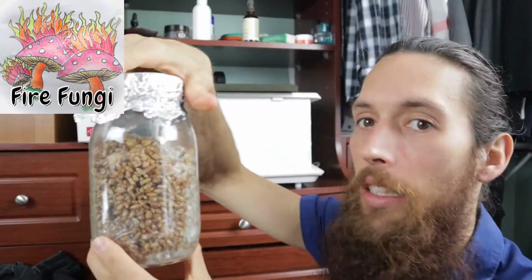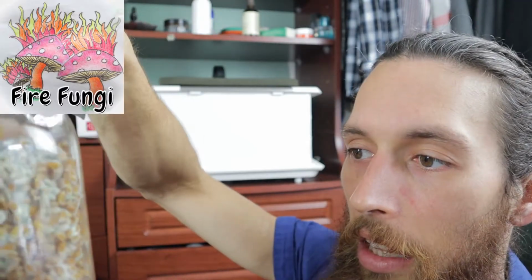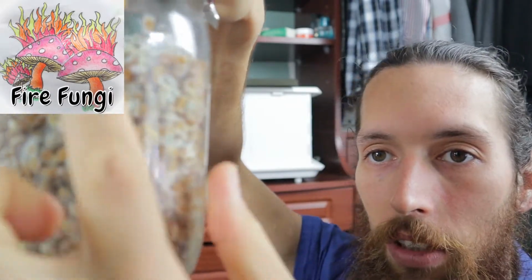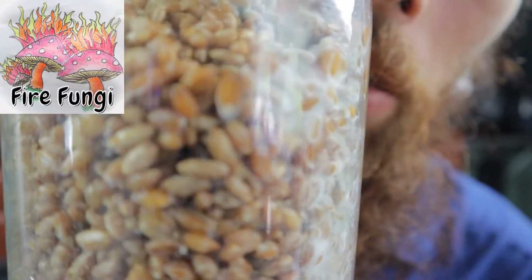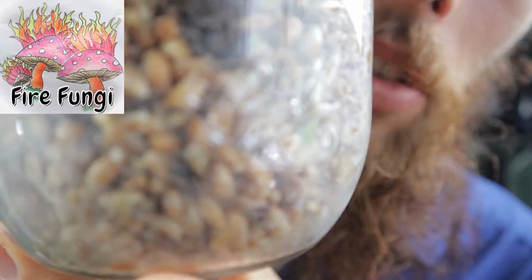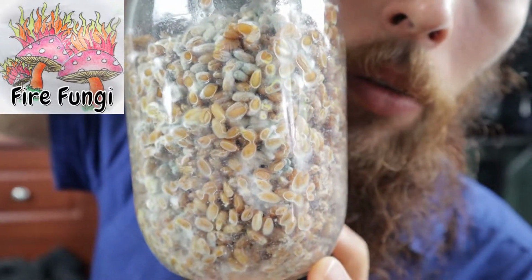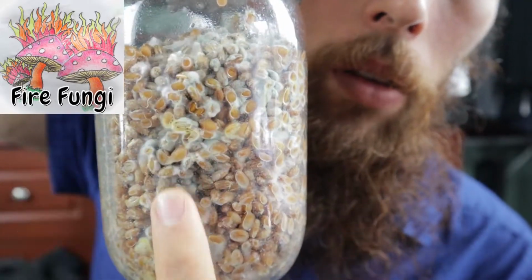Alrighty then. So I did notice that it wasn't running quite as fast. The golden oyster mycelium here wasn't colonizing the grain quite as fast. As you can see, it's not as strong of a growth. You can still see some mycelium growing here, some growing right there. You can see some patches of mycelium growth there, along there.